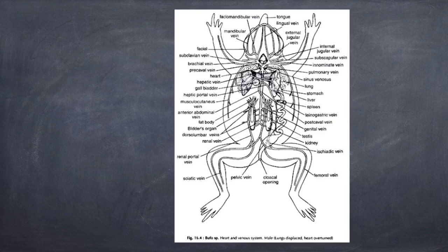Pericardial cavity is a small body cavity located on the thoracic region, the cavity that holds the heart. The heart in the pericardial cavity is enveloped by two transparent membranous tissues. It is a three-chambered heart. It has two anterior atria and one posterior ventricle.